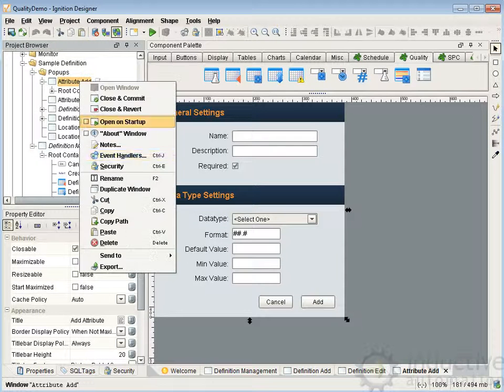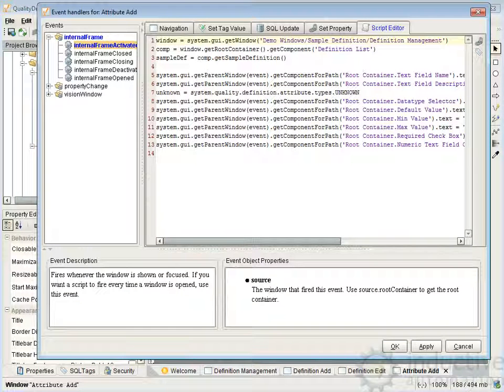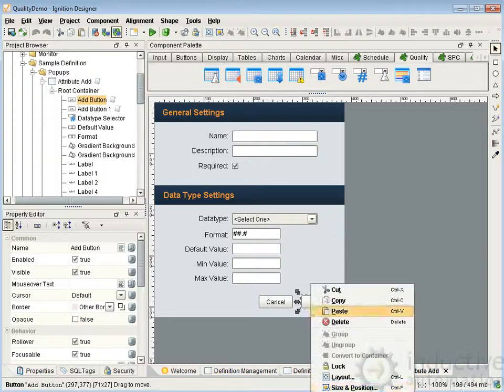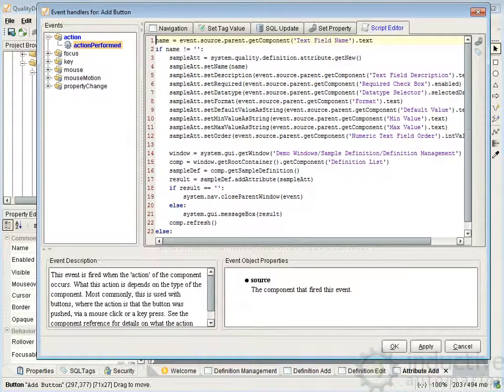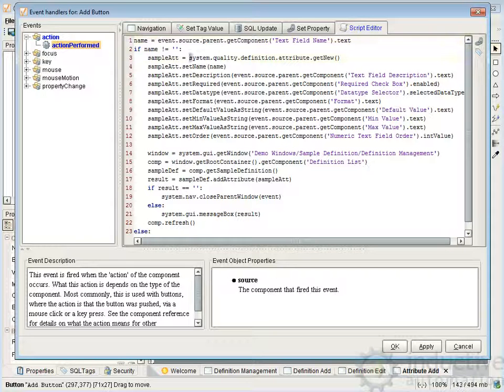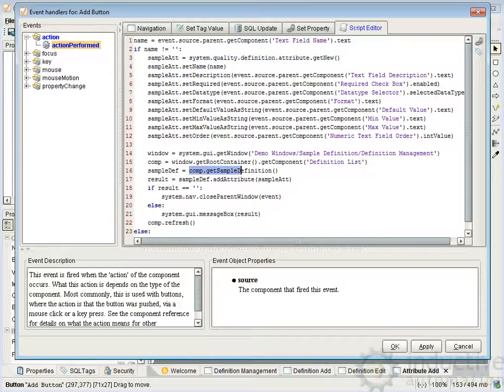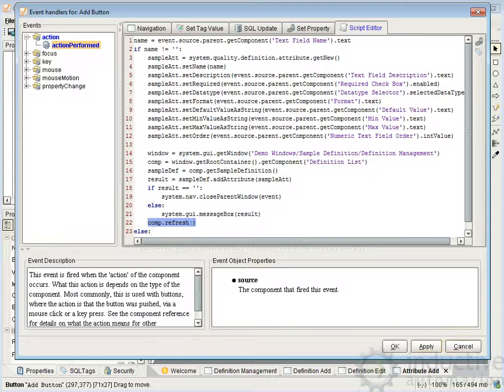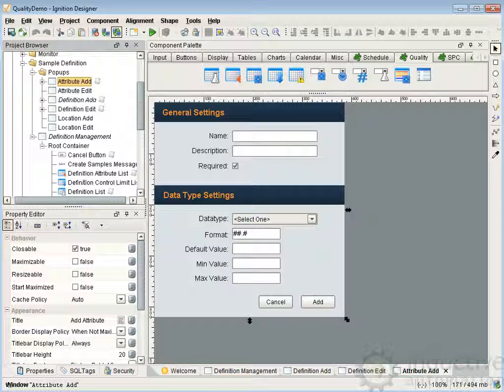For attribute add, there's the script. When the window comes up, it initializes all the entry boxes — I won't go through that again. When you add, it's the same kind of process: we create a new attribute, we set all the parameters for it, then we get the component, get the sample definition, and add that attribute to the sample definition. The refresh then causes the sample definition and attribute list to update to reflect the newly added attribute. Edit attribute works in that same way.